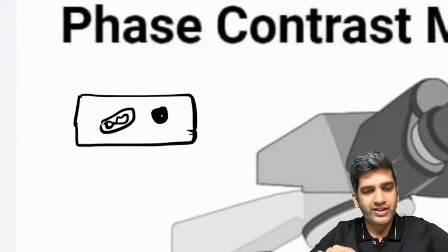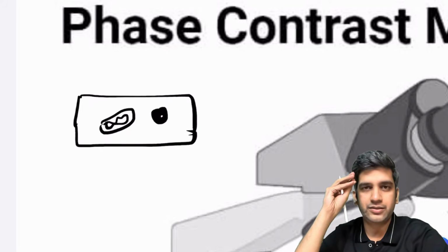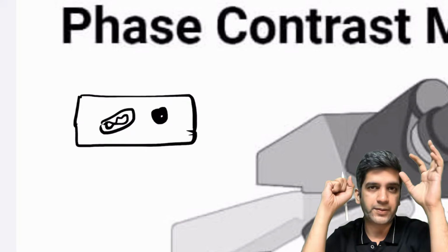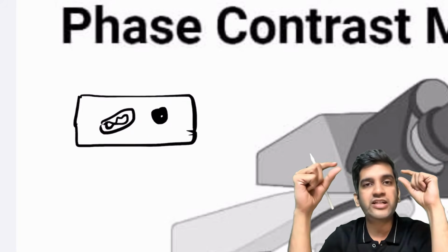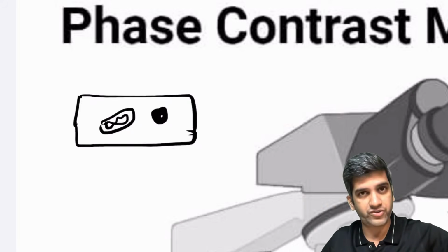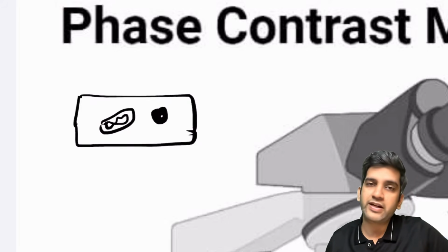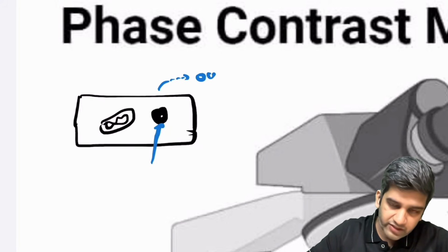Will you accept that when I say a nucleus is sort of dense, mitochondria is a little bit lighter? Because the nucleus is full of chromatin, mitochondria is a little bit of membrane, fluid and everything. So both of them are different in density amongst the structures, though they are cell components. Cytoplasm has a different density. Peroxisomes might have a different thing. So what happens is, when the light hits here, it gives a different output or a different image.